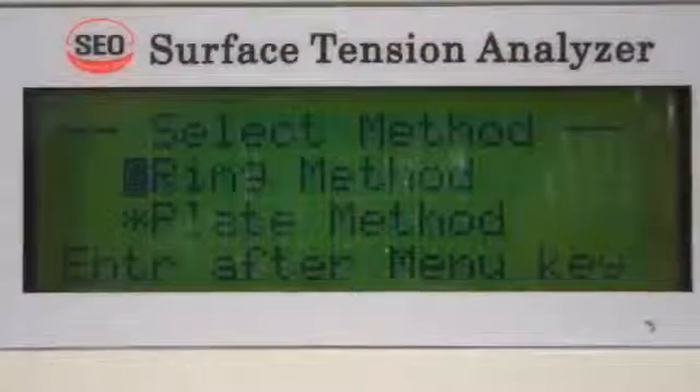Select tension measurement to begin a test. Choose the Denoy ring method or the Wilhelmi plate method.